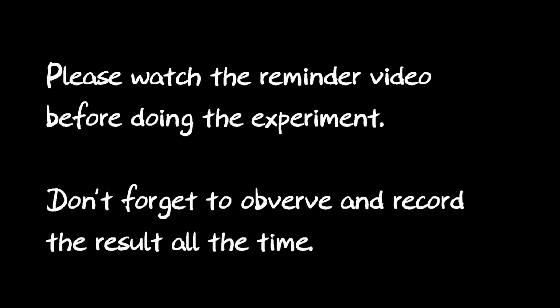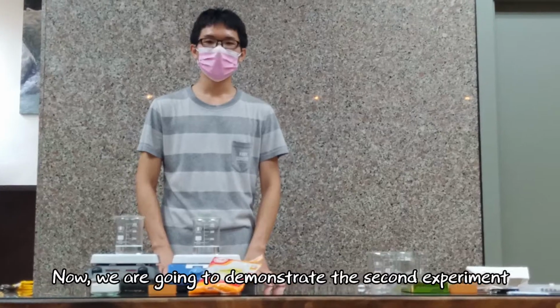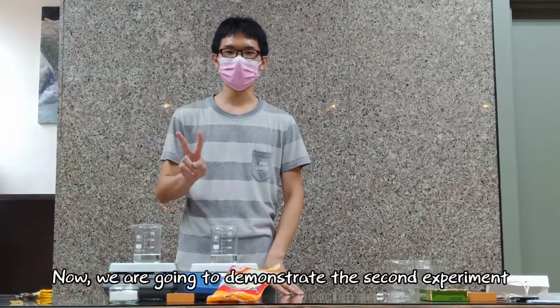Please watch the reminder video before doing the experiment. Don't forget to observe and record the results all the time. Now, we are going to demonstrate the second experiment.